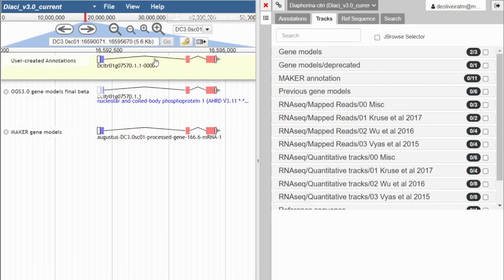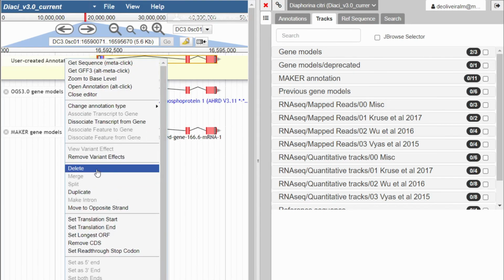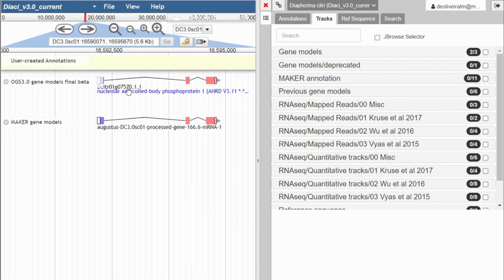It's not set in stone, right? You can put something into the annotator box and you can delete it, and it doesn't immediately have an impact on what is in the official gene set at the moment, right? But whenever the genome updates officially and goes from 2.0 to 3.0, all of the stuff that was put into the annotator box gets incorporated officially into the next gene set.